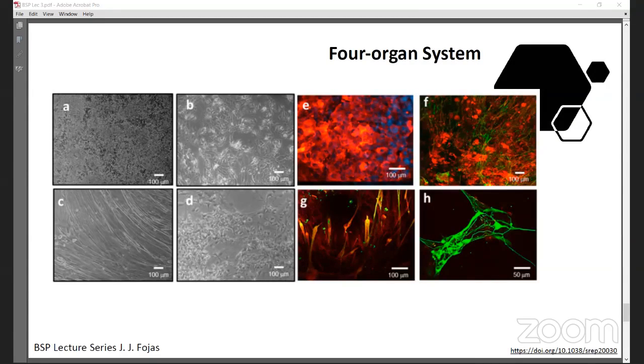So in this work, they demonstrated a 4-organ system with continuous recirculation of a serum-free medium that mimics human response to 5 different drugs for at least 14 days. The system measures electrical and mechanical response to various drugs as well as metabolic response. The design uses a pumpless system, which is simple, mechanically reliable, and low cost. And also the system, like I mentioned, is modular and reconfigurable, and the organ systems tested, both the liver, cardiac, neuronal, and muscle, represent the most important organs in terms of side effects leading to drug candidate failure. So these are very common organs that we use when we're dealing with cytotoxicity in the lab.